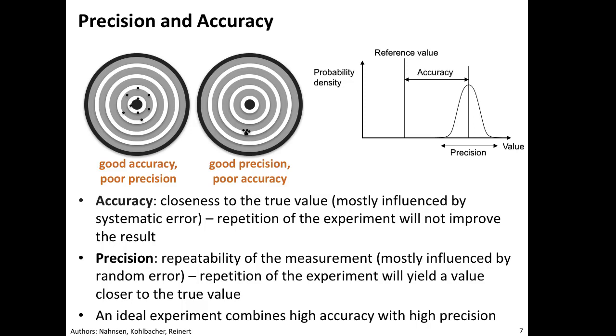Yeah. If you have a relative comparison, you're trying to treat versus control. If you have good precision and there's some systematic error there, but now you know the difference and you have a very good control of your standard deviation, that to me is more important than having the right value but have a lot of scatter in the data where you may not be able to pull out the difference. That, as I said, depends on the situation that you have.